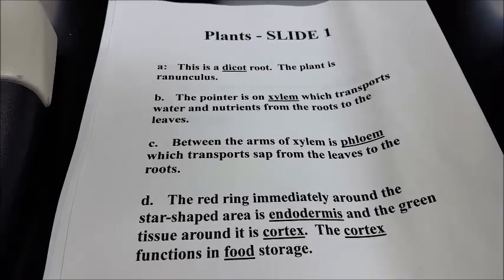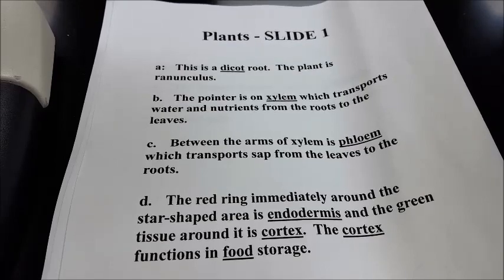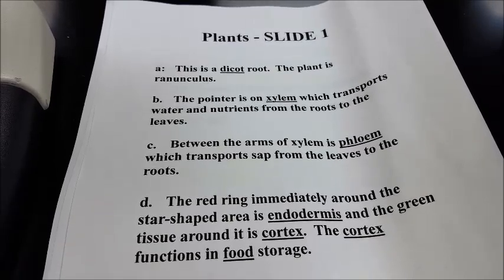The slide that we will look at is a ranunculus. It is a dicot. The pointer will be placed on the xylem which transports water and nutrients from the roots to the leaves.